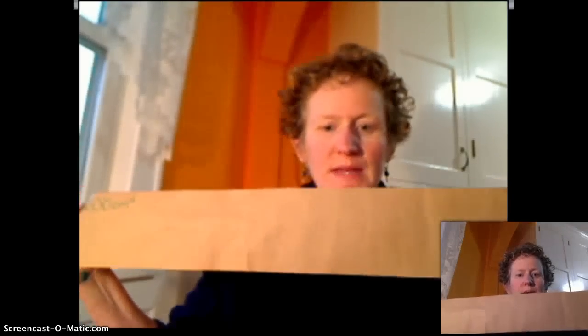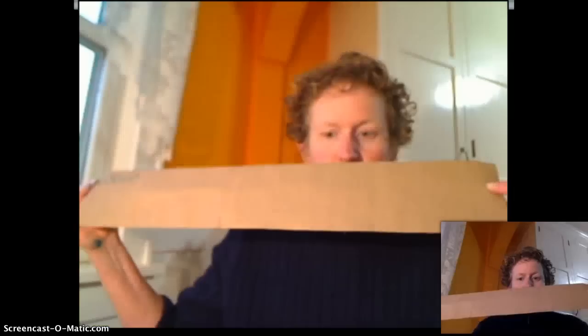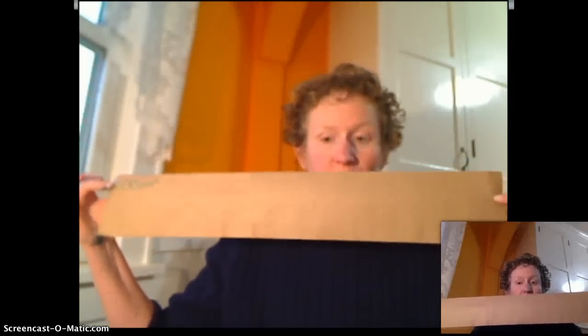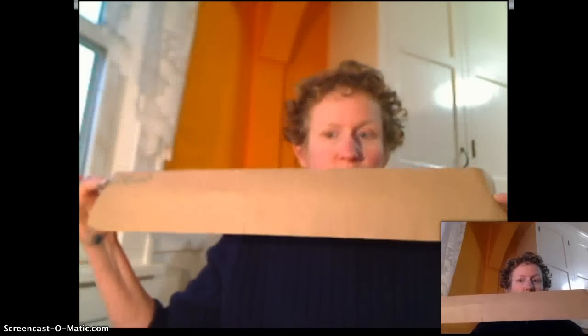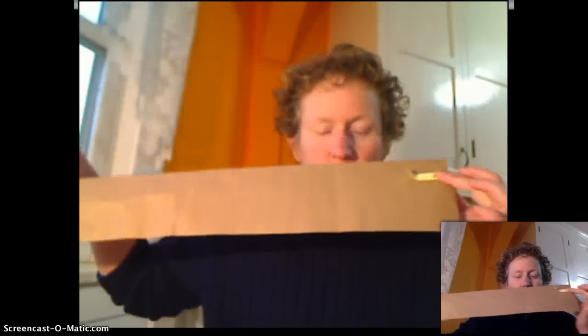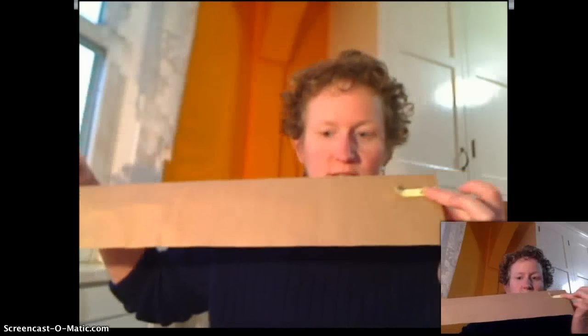There's a really big difference too in the surface area. This is 600 square centimeters. This is the surface area of our big cube. This is 6 square centimeters. It's the surface area of our little cube. So for comparison, you can see there's a huge difference in surface area.